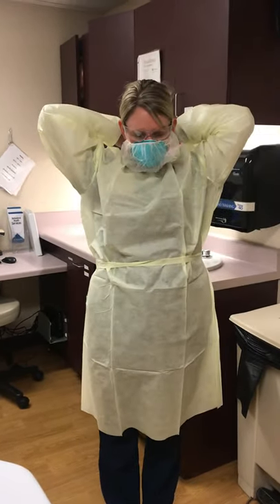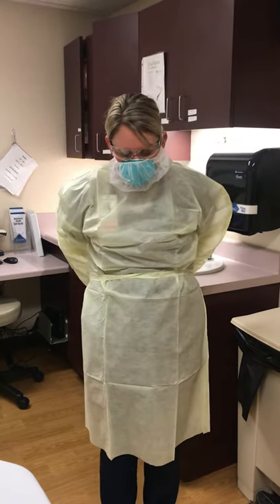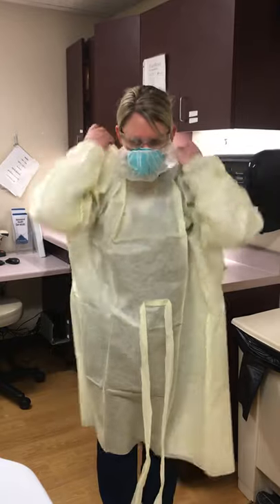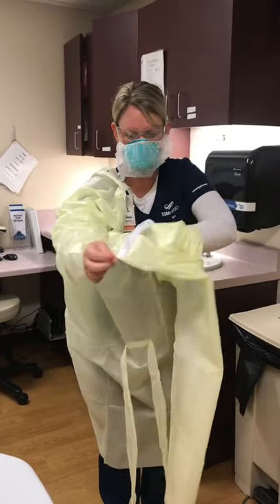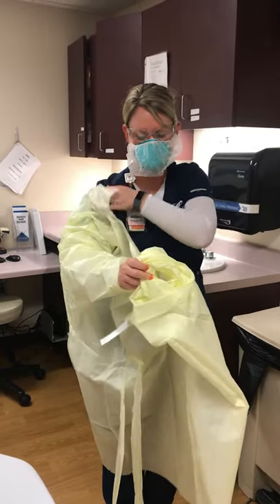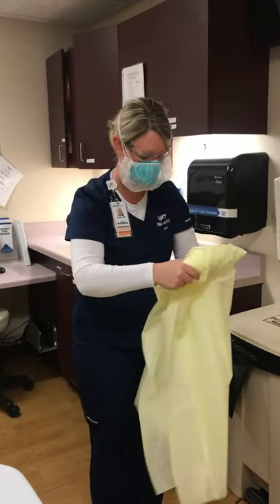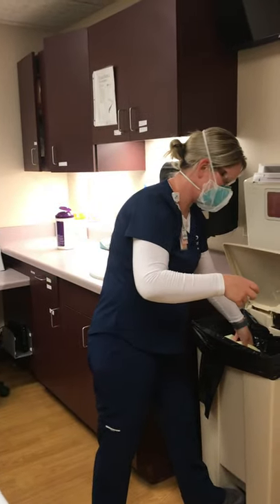Next, I'm going to remove my gown. Being cautious not to touch anything on the outside of the gown, rolling it down into itself. Disposal.